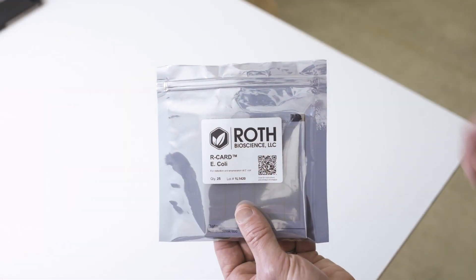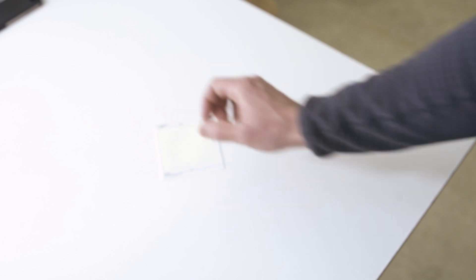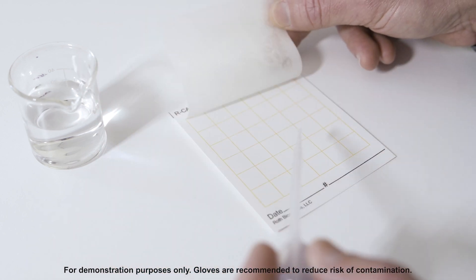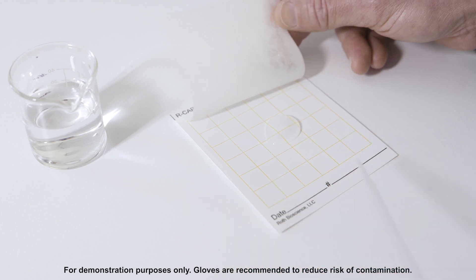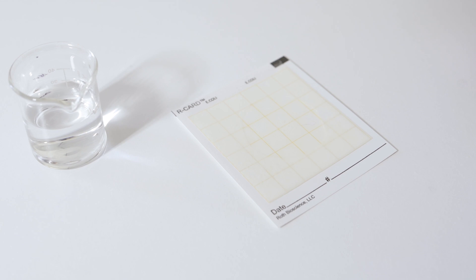Let me show you how it works. The first thing you want to do is take your card out of the package it comes in and place it on a level surface. Next you want to flip up the thin plastic layer, holding it back, and then lastly you put your sample — one milliliter sample — right in the middle of the card and let the plastic go over the sample. You can see how it naturally spreads out.